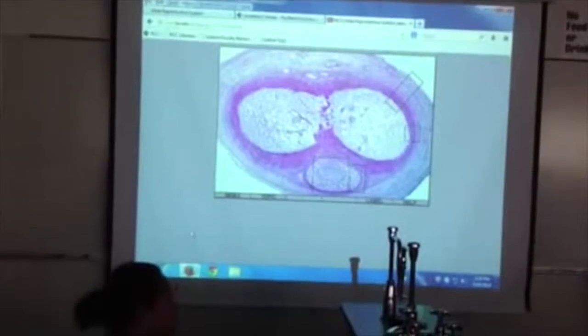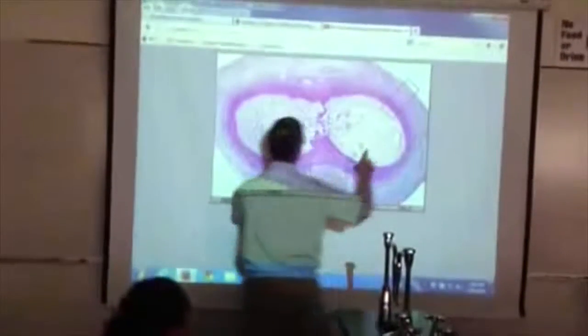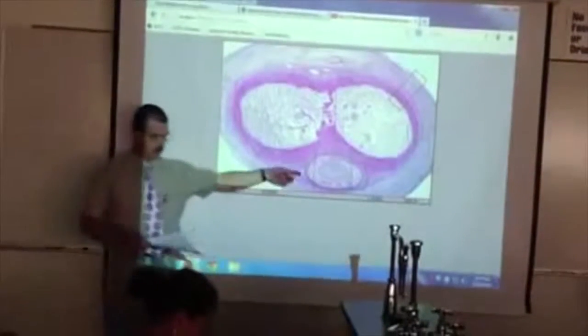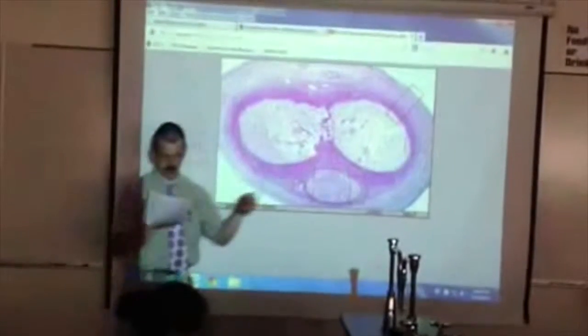So, let's figure out what you're supposed to know about said penis. Well, I think you're supposed to name the parts. So let's name the parts. Let's do the eyeballs of my clown. What are they called? Cavernosa. The corpora cavernosa. The mouth of said clown. Spongiosum. Corpus spongiosum. The urethra, you know. What kind of tissue is the eye and the mouth made out of?